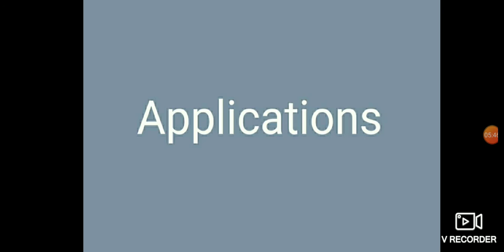TEM can be used in semiconductor analysis and production and the manufacturing of computer and silicon chip technology. Companies use TEMs to identify the flaws, fractures, and damages to micro-sized objects. TEMs provide topological and graphical information also. The images allow researchers to view samples on the molecular level, making it possible to analyze structures and textures.